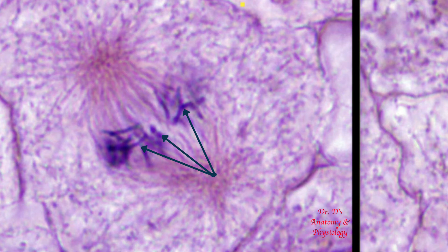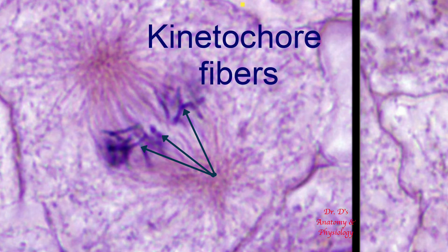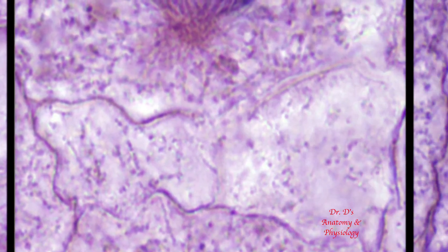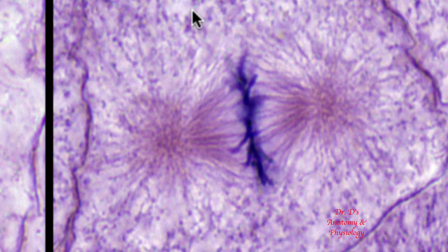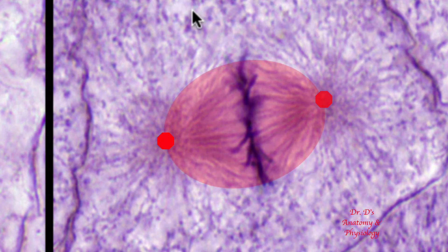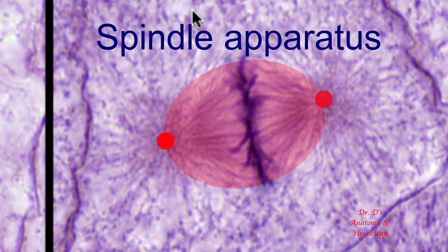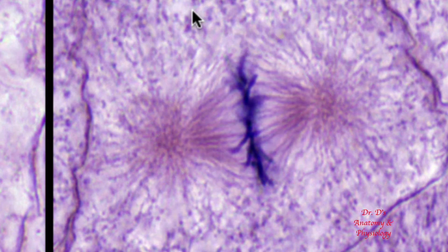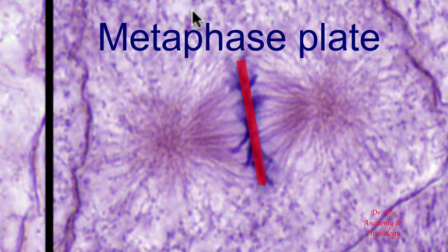These microtubules are called kinetochore fibers or microtubules. Here is a cell at a later stage of metaphase. Note that the chromosomes are diametrically opposed and the fibers extending from each form an ellipsoid shape as they extend to the chromatids. This configuration of fibers is called the spindle apparatus. At this point, the attached chromatids have moved to the center of the cell and are arranged like a disc or flat plate. This is called the metaphase plate, which is characteristic of metaphase. Because it occupies the wide center of the spindle apparatus, it is also called the equatorial plate.